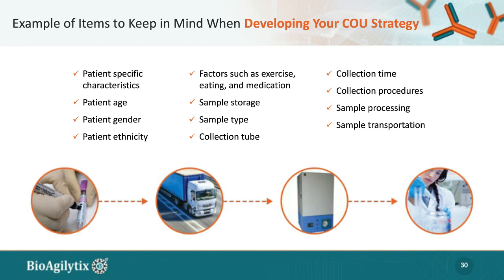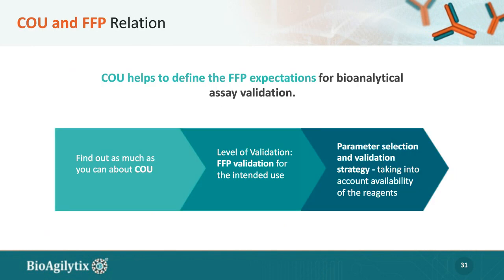It's just not a black box. And the more information that we know and discuss, and that they're willing to share with us, the more we make sure that the validation is done properly to meet these needs. So that's something that, if you're an external bioanalytical lab or internal bioanalytical lab, make sure you have these discussions. Now let's talk about the context of use and fit for purpose.